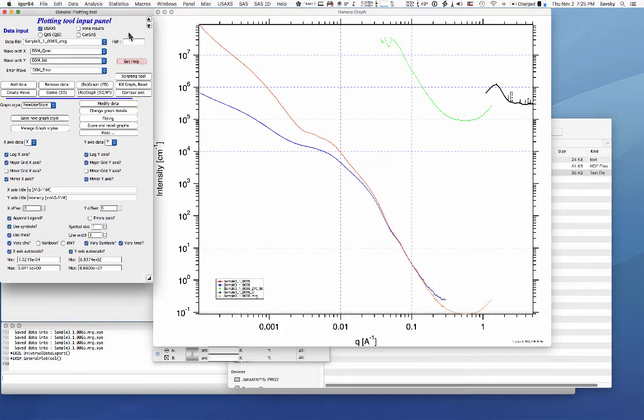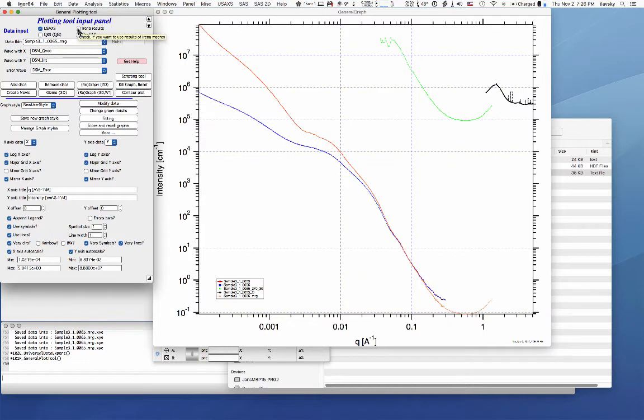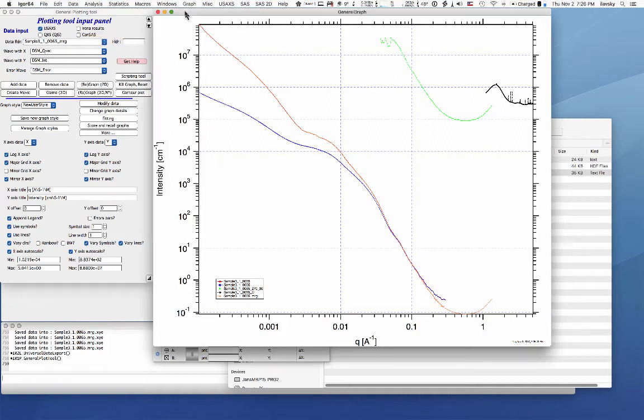There's actually a third set of types of data. If you have used IRENA to generate results, so for example you fitted a size distribution, it will be called IRENA results. And so that way you would check this checkbox, ignore the CanSAS. You would check this checkbox and then you could deal with size distributions, unified fit models or any other result of the modeling.